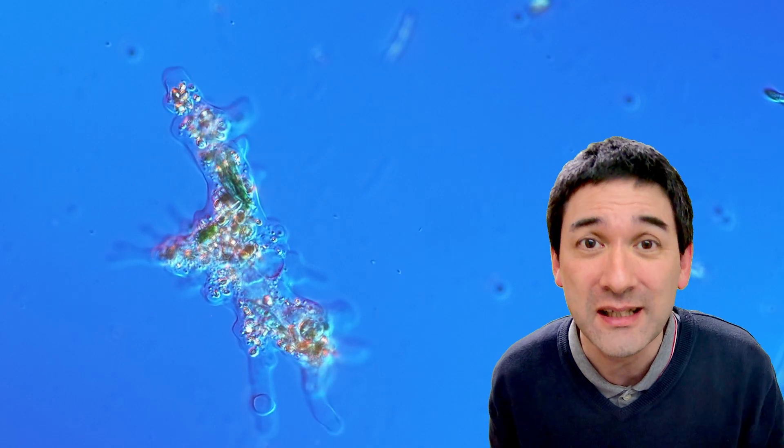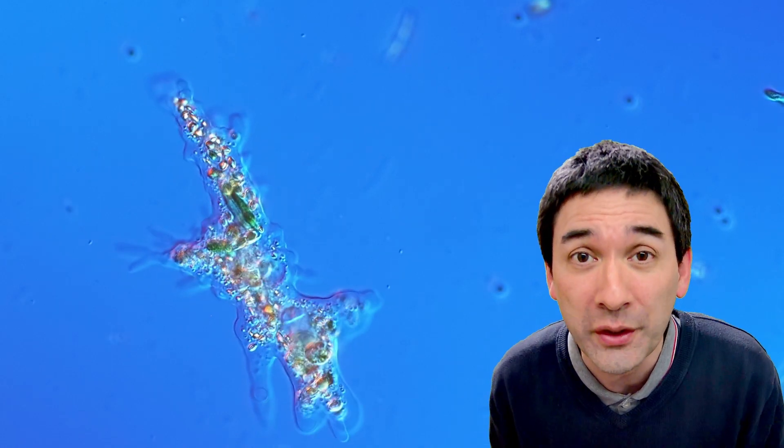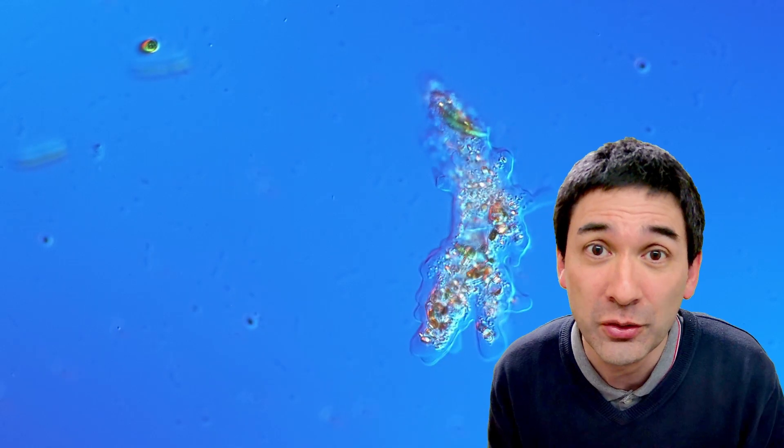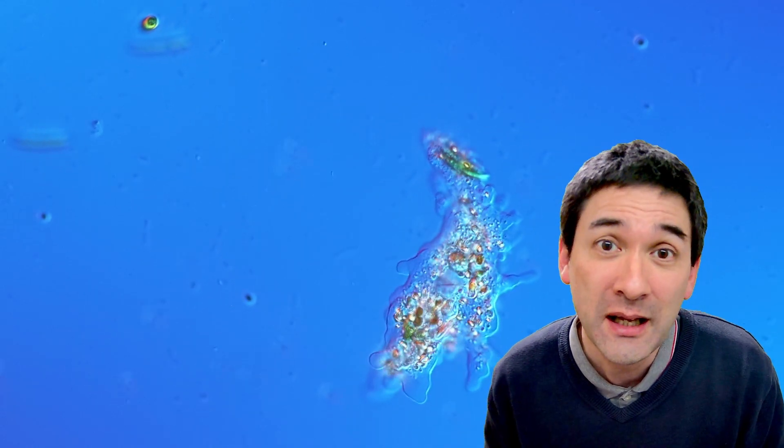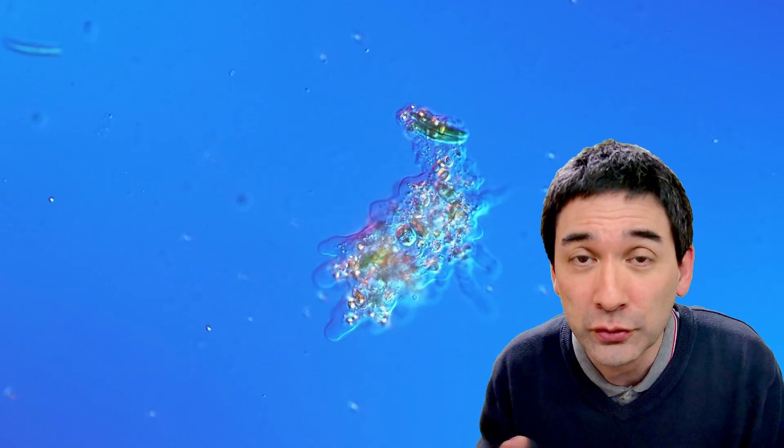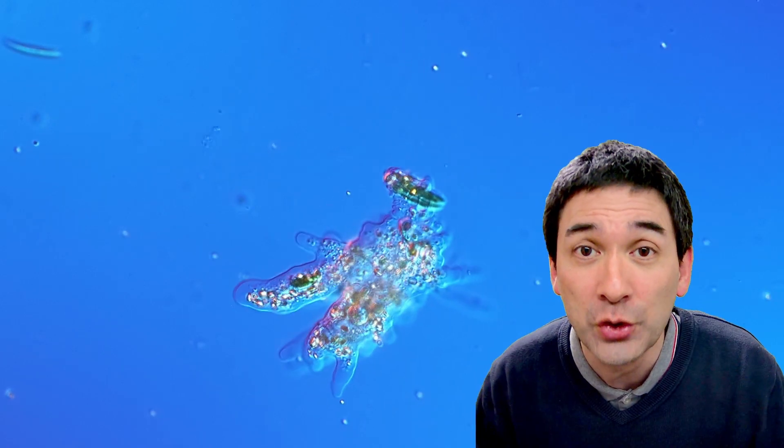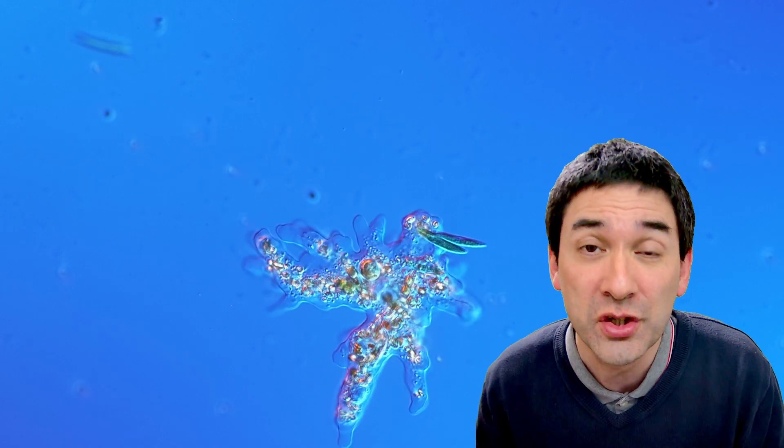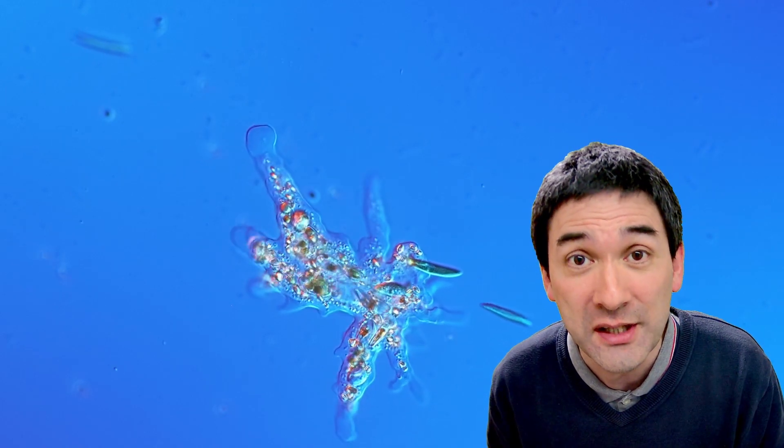Amoeba are single-celled organisms or water organisms that are able to change their shape just like this one over here. You're seeing it right now in time-lapse and what they do is they move around changing their shape and also engulfing other microorganisms as a source of food.